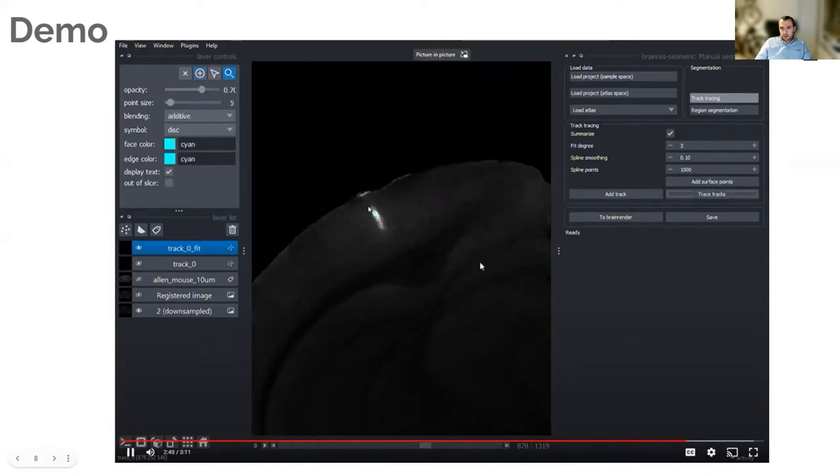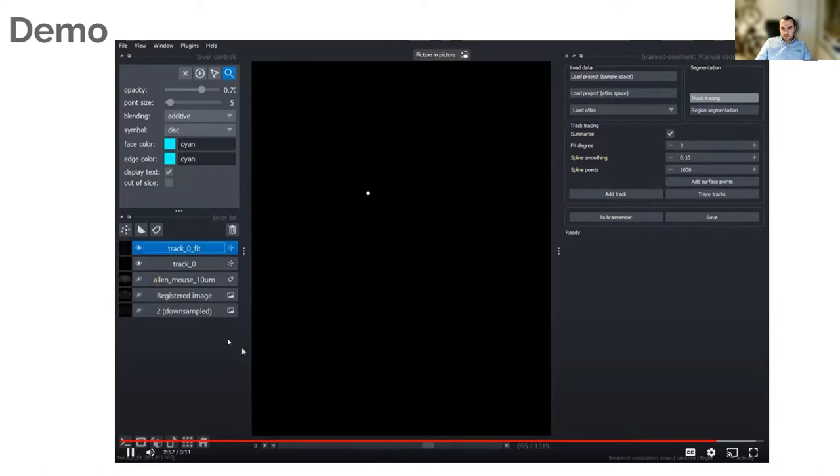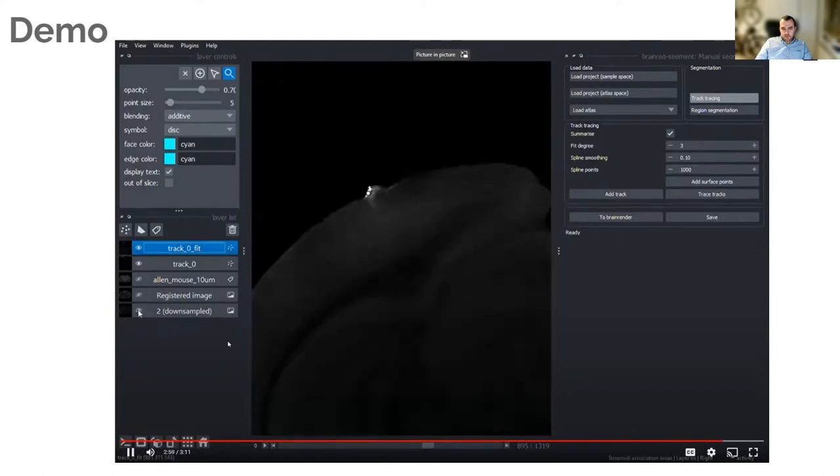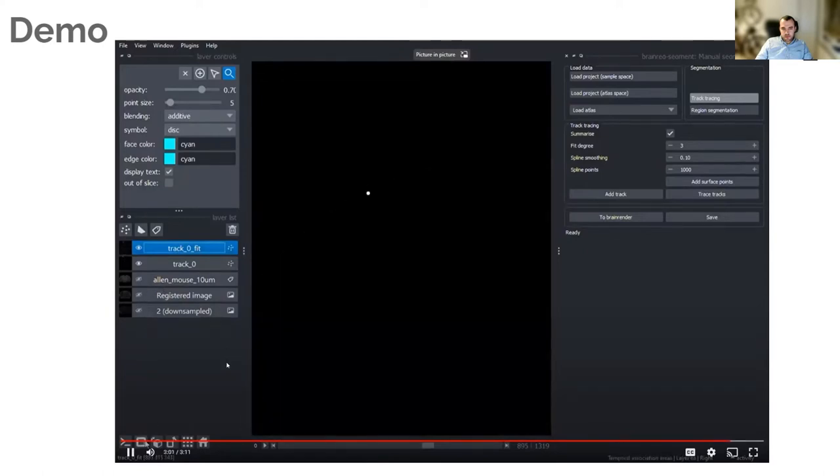You click trace tracks. It joins them up and makes this blue line that's kind of hard to see. But if we turn the raw data off and just look at it in 3D, which I think is coming next in the video, you can see that it is a line along the track. It's a slightly curved line.